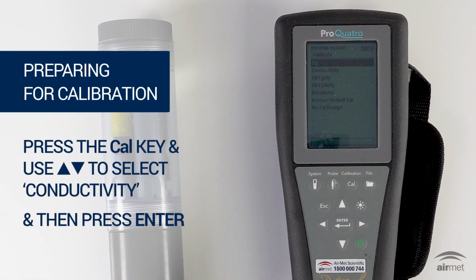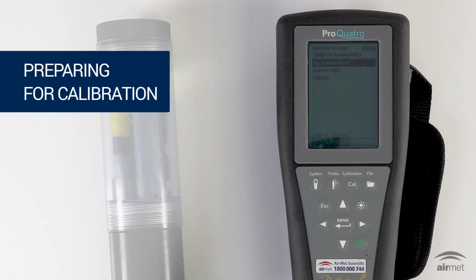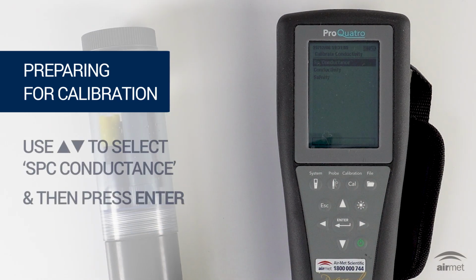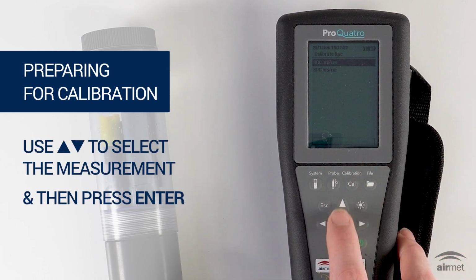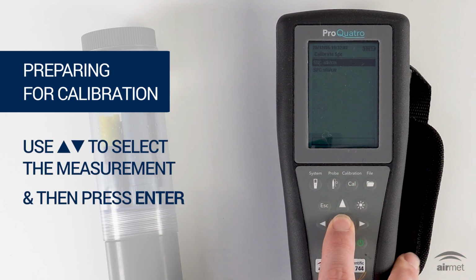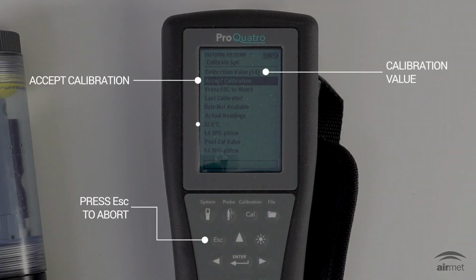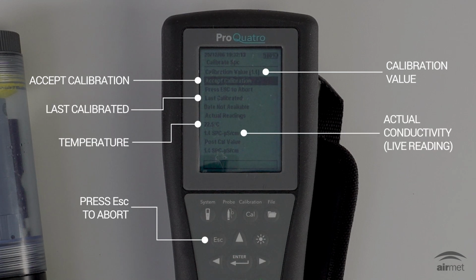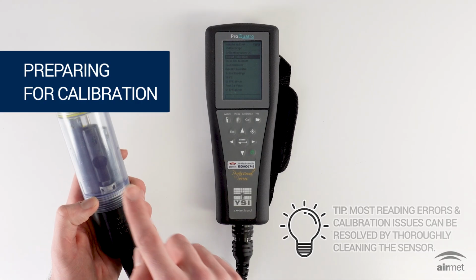To begin, press the Cal key and highlight Conductivity. Then select Enter. This opens up the calibration options for the sensor. Select SPC conductance and then select the measurement you're using, in this case microsiemens per centimeter. The on-screen menu shows the calibration value, accept calibration, pressing Escape to abort, temperature, last cal, actual conductivity live readings, and status menu. Clean the probes before you do anything.